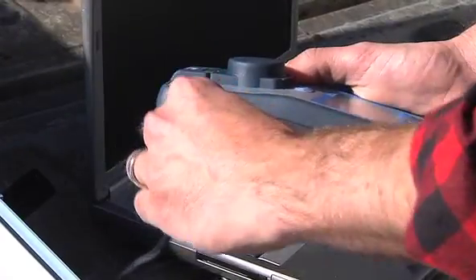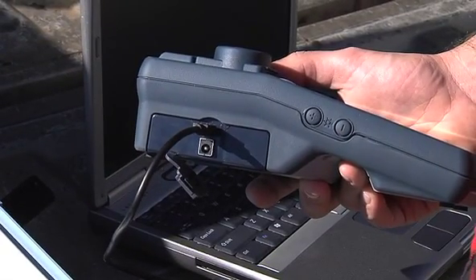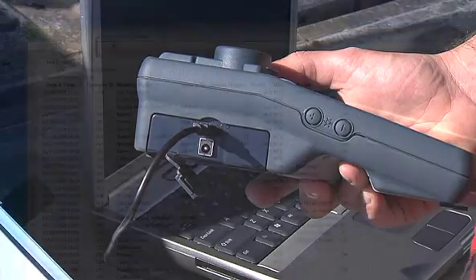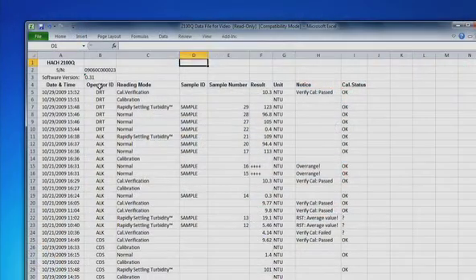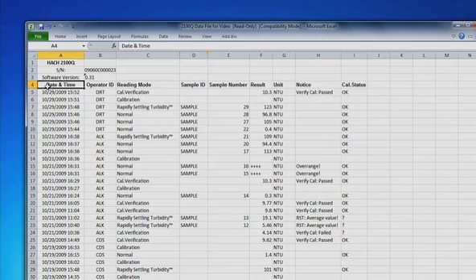Measurements are stored, and data transfer is as simple as plugging the optional USB module into your computer. Data may be filtered by operator ID, sample ID, and time interval, in addition to other parameters.